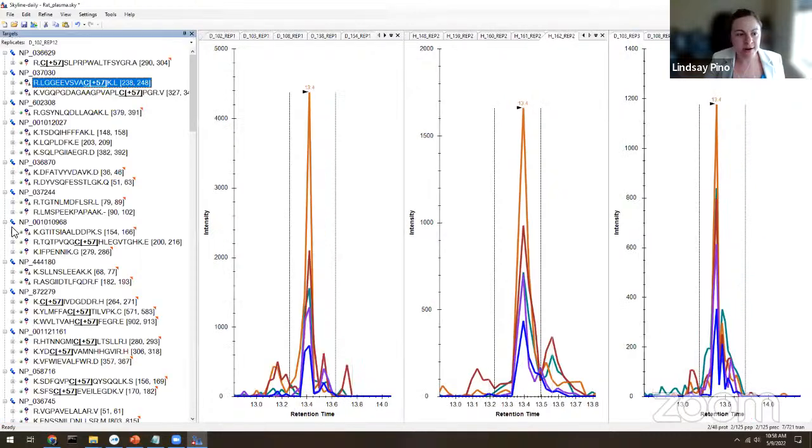I'm going to drag my target window back to the left-hand side because that feels very weird to have the targets on the right-hand side. I never see anybody do that, but maybe that somebody is you.